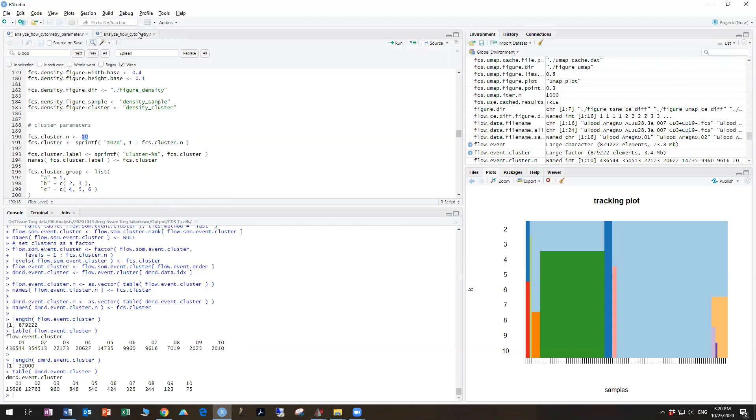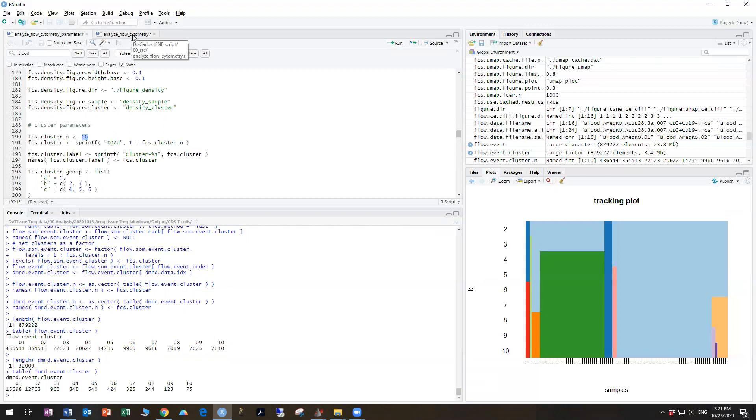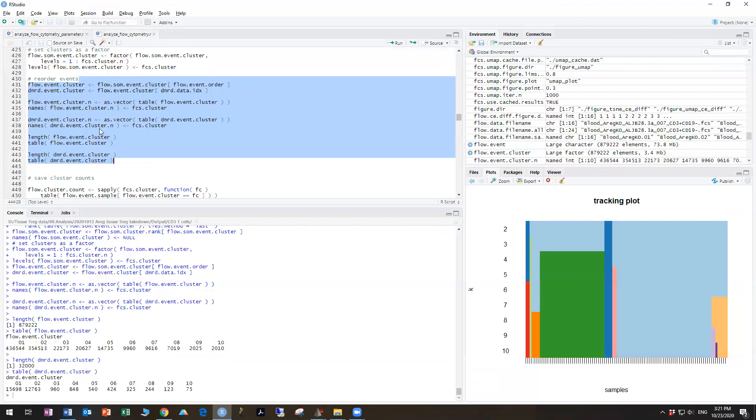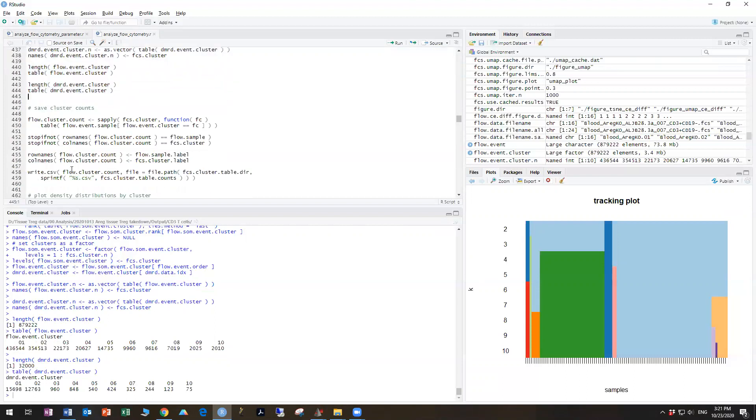and then looking at that to say, all right, how does my phenotype in my NKT cells change in terms of the clusters, rather than trying to both look at phenotypes and cell types at the same time, which is what you would be doing by running a total CD45 gate.